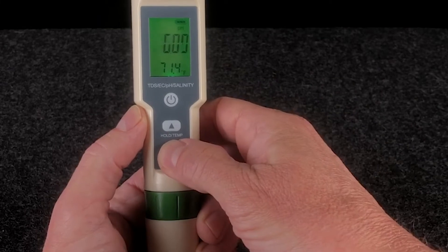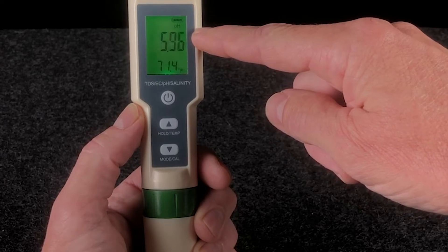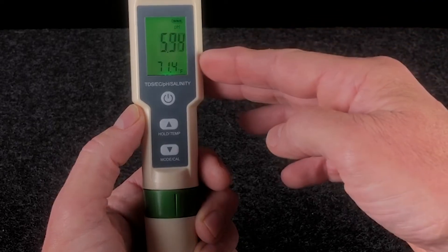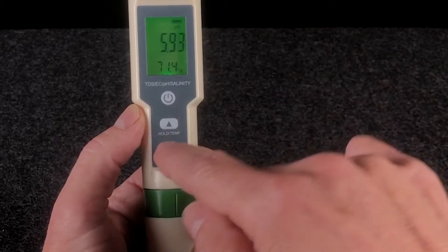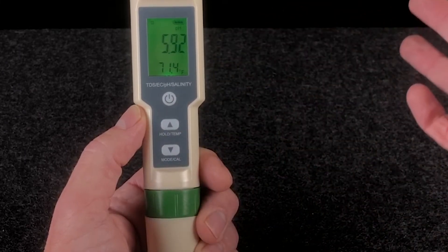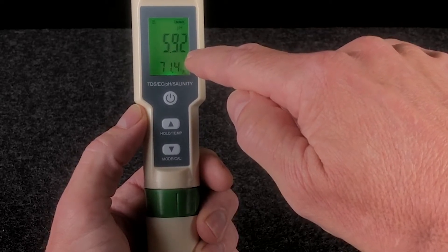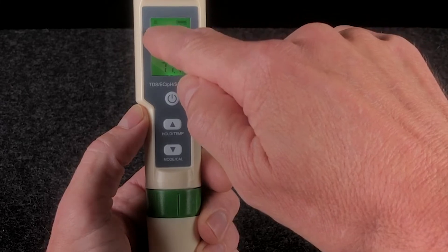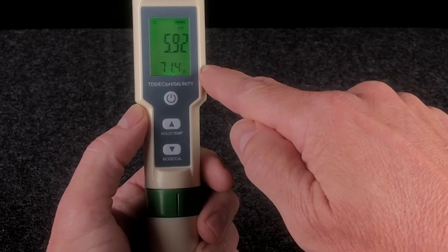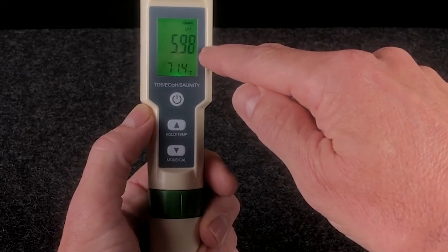Hit the mode button again — that places you in pH mode. Notice the numbers are drifting; that's completely normal behavior for these types of meters. After about five seconds in the tested solution, what you want to do is hit the hold button. The hold button, after about five seconds of testing, will freeze the display and will provide you with your reading. Notice that once you hit the hold button, there's a small H displayed in the top left of the display — that's to let you know that the hold is on. To release the hold, simply press the hold button again and the numerical drift will resume.